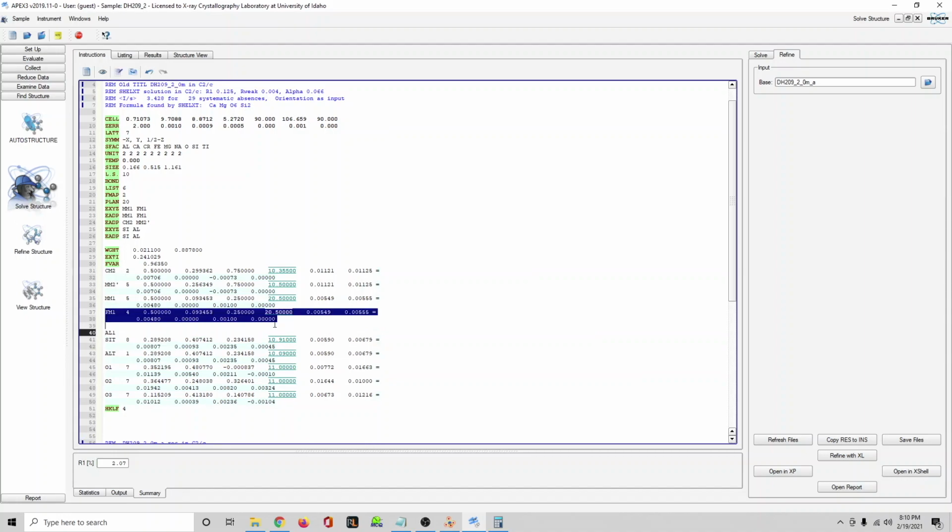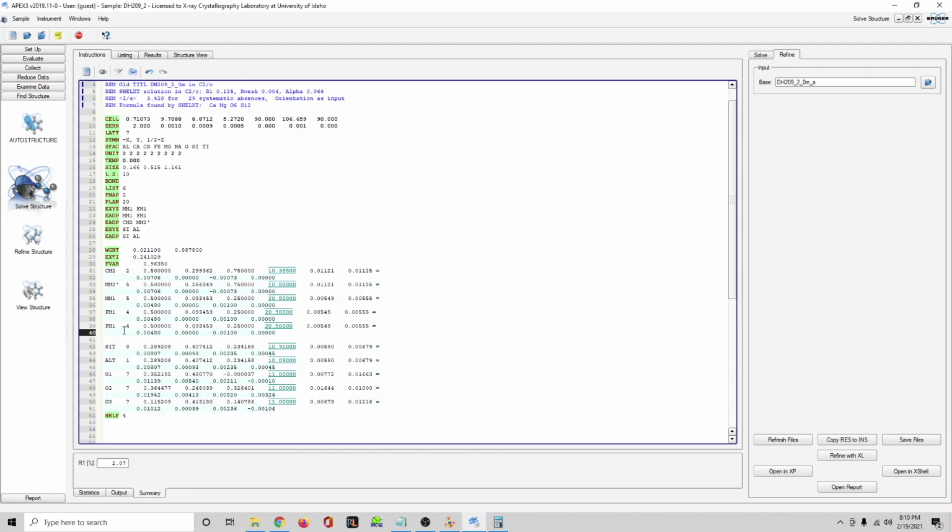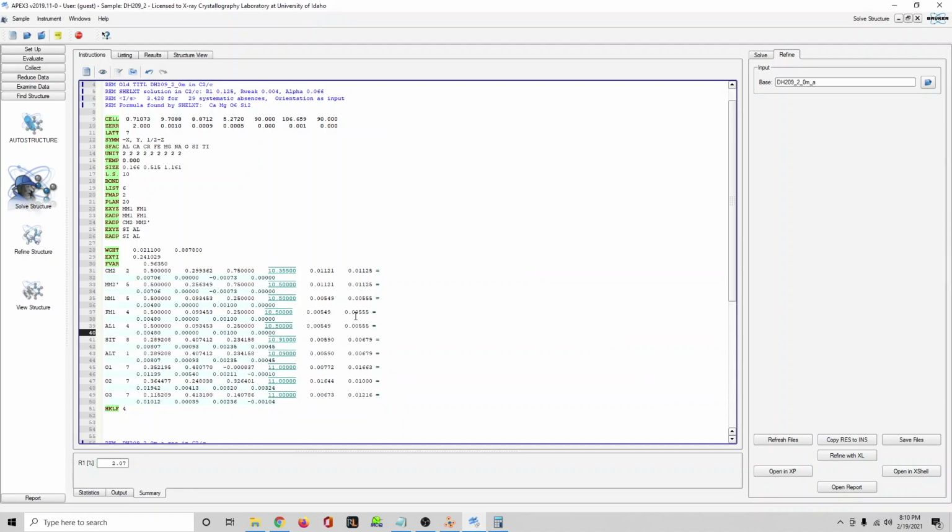So we'll use the coordinates and EADP of the other octahedral thing and rename it that. 1, 1, 1. So now you can see that we're really not refining anything. We're using very few parameters to refine, which is good in a lot of ways if you can get away with it. And it's actually the proper way of doing a complete study on a crystal structure, even though it's also acceptable to refine these percentages, as long as there's, I mean, once you get over 3 occupants in the same site, then it's just kind of nonsense refining the ratios, but 2 is definitely fine.